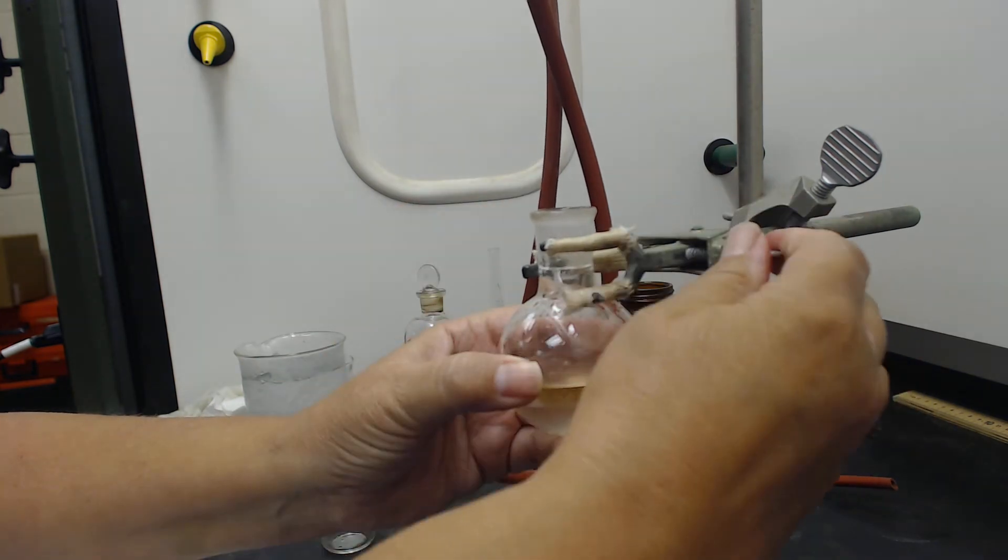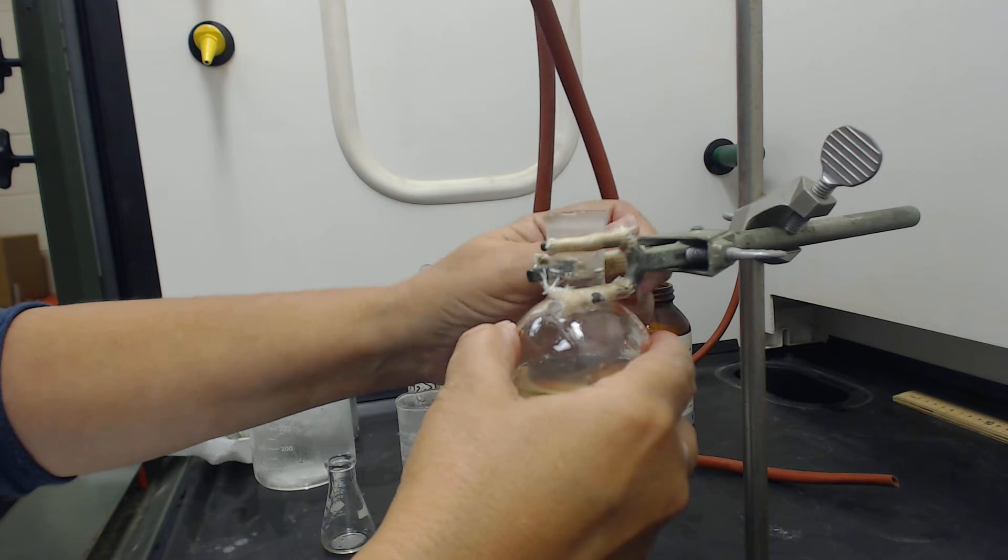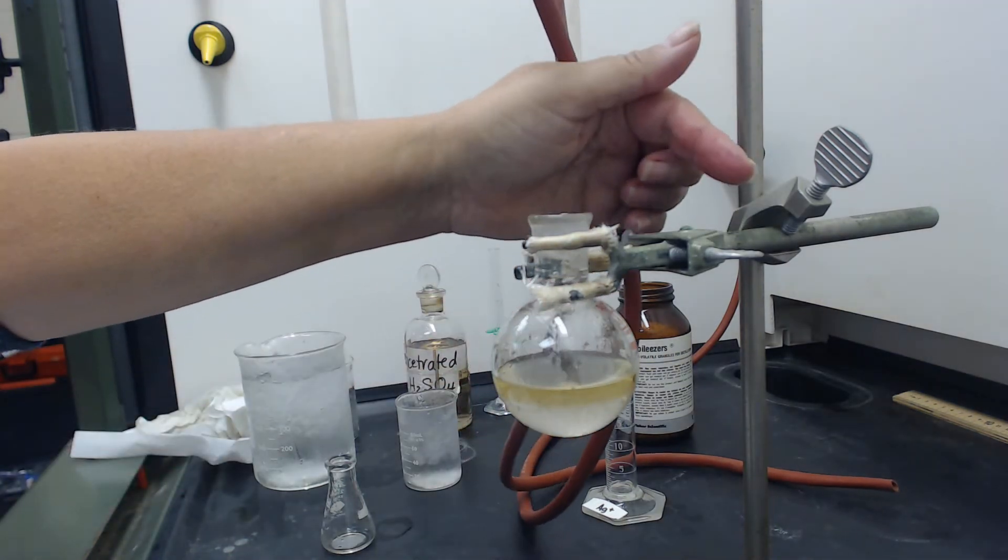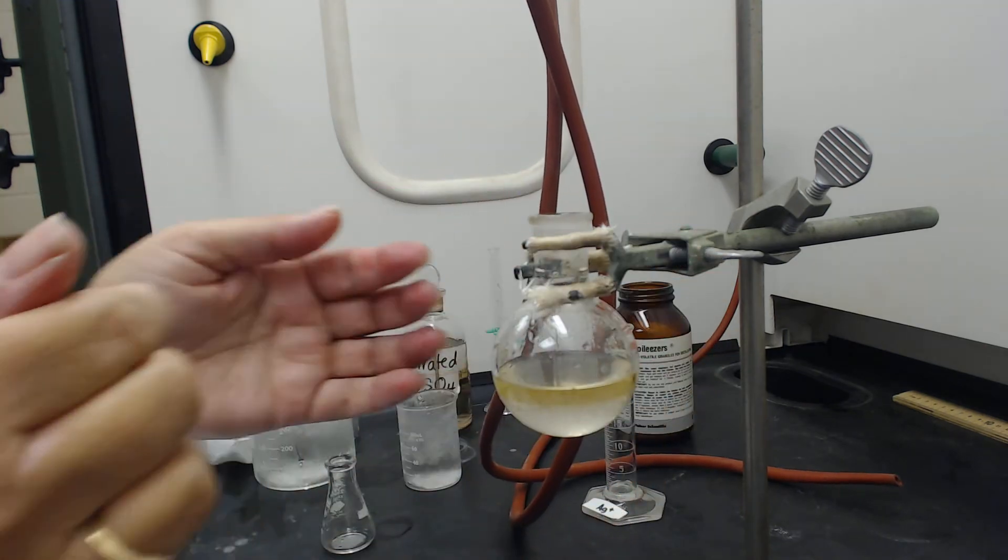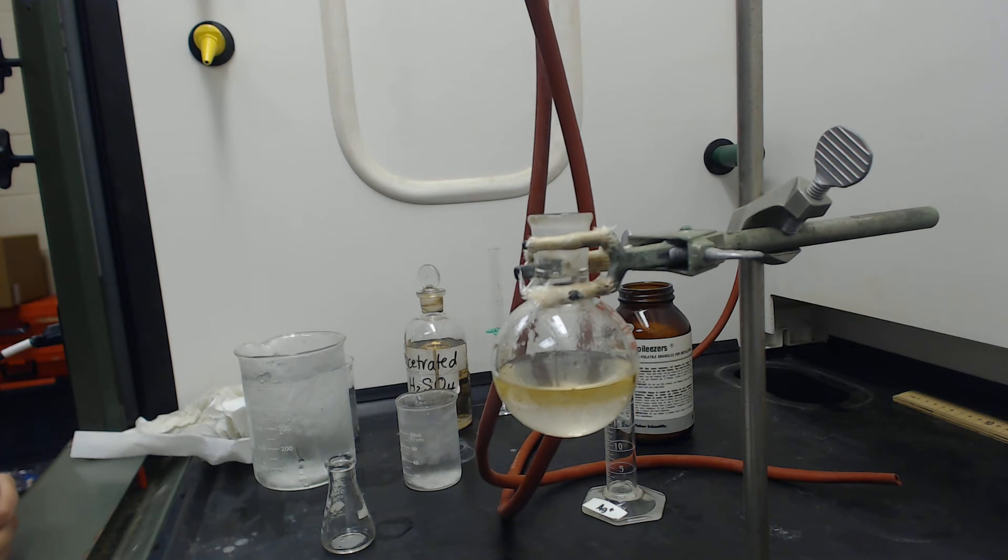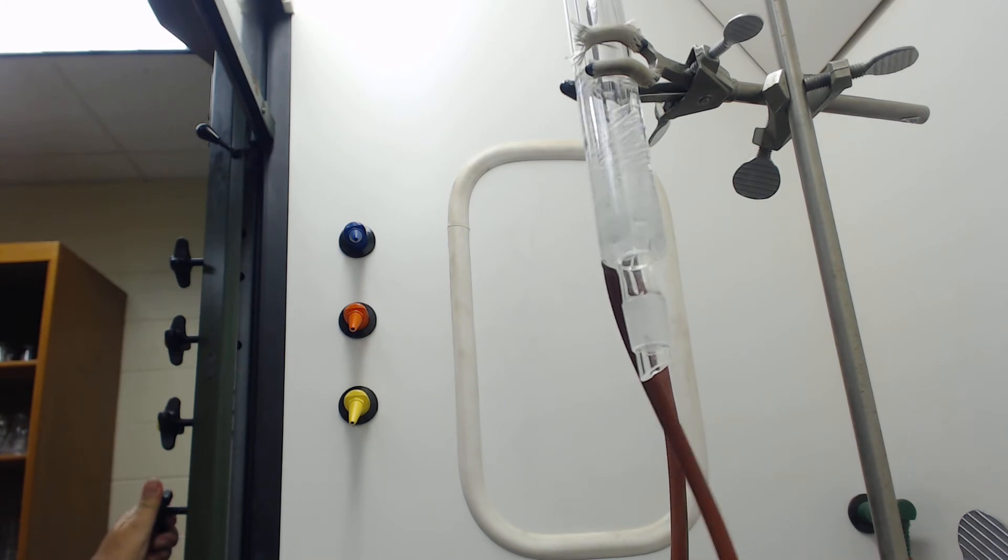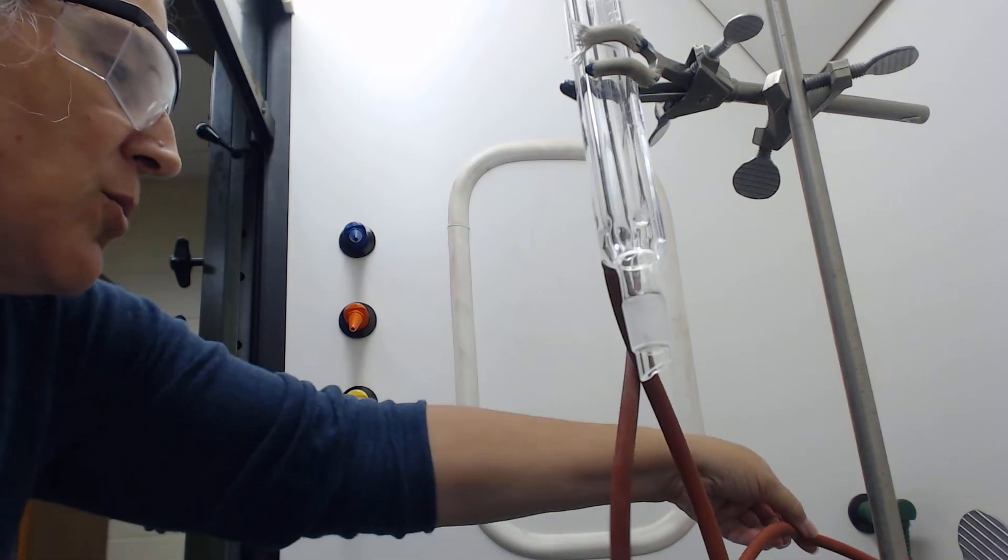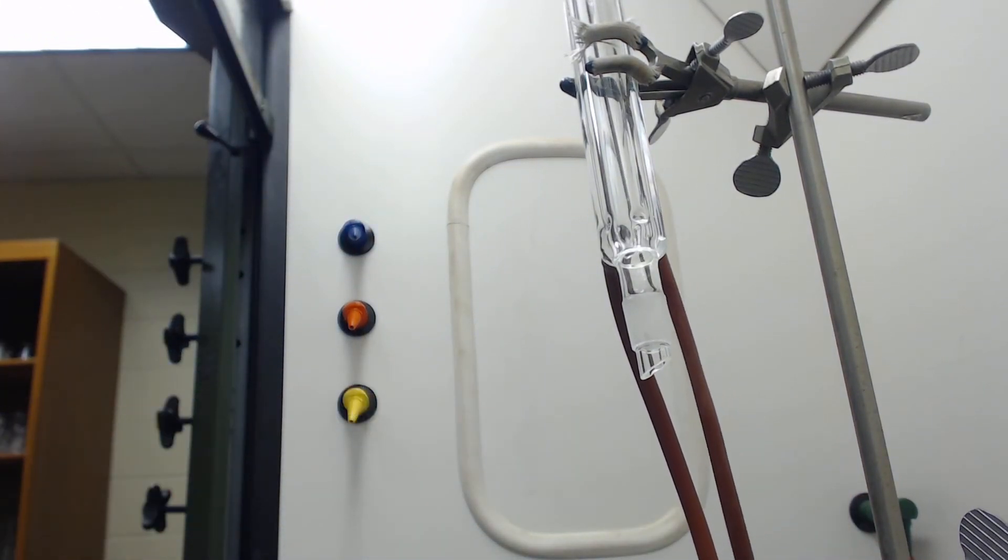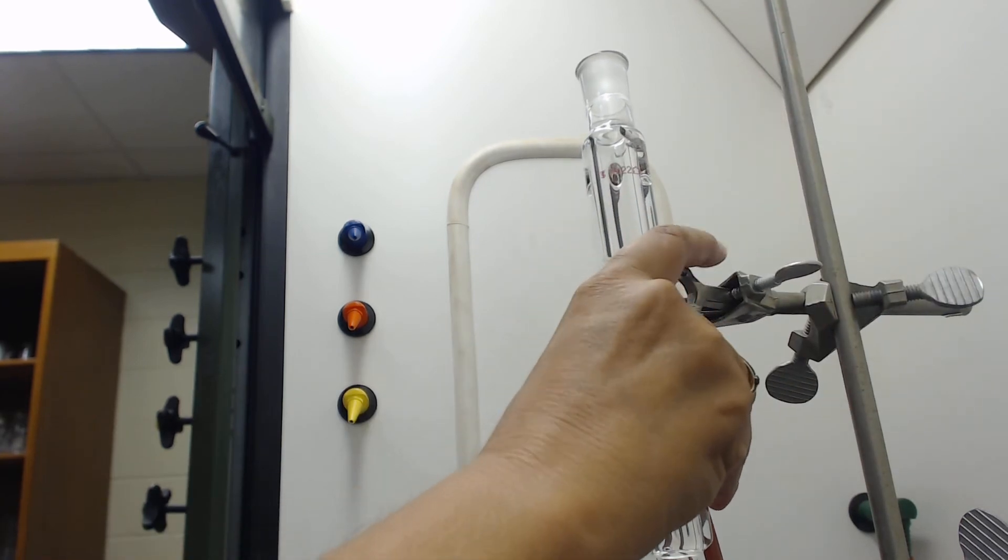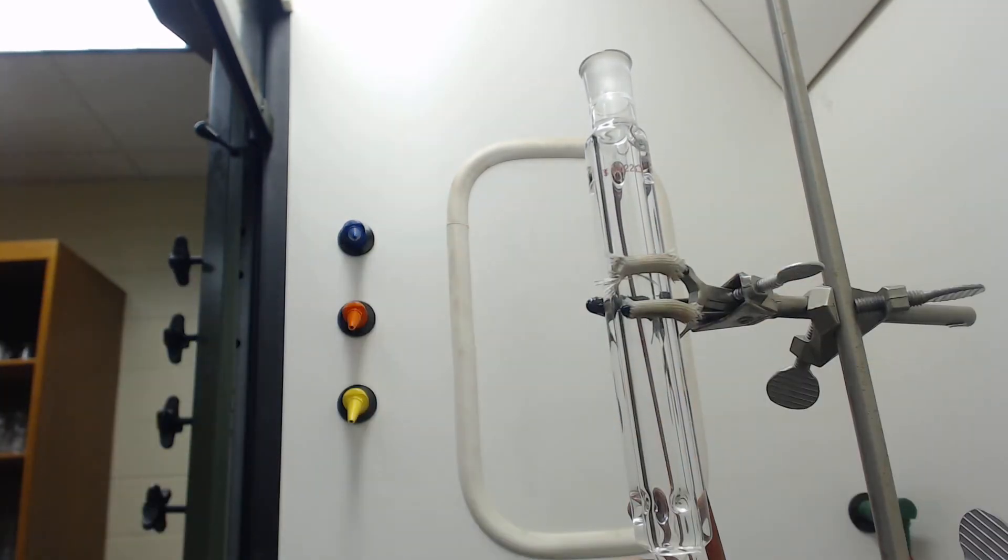After the addition is complete, remove the round bottom flask from the ice bath and fit it with a heating mantle. I've got it clamped. In case you hadn't seen this before, this is a universal clamp which is really nice. This is a condenser like we use in distillation, but this time we're going to fit it in here.